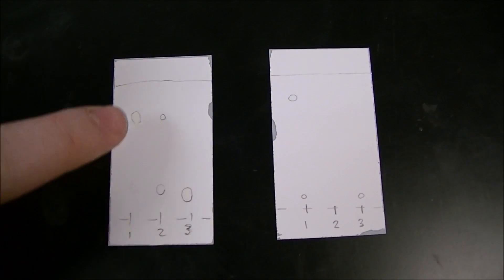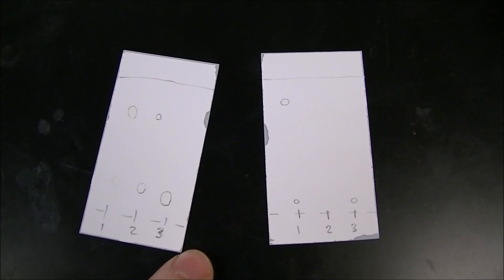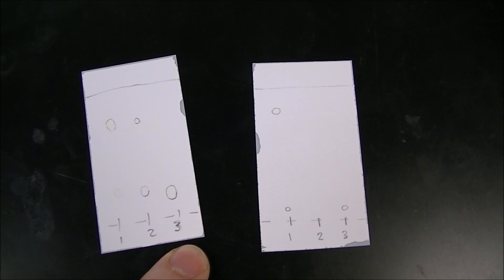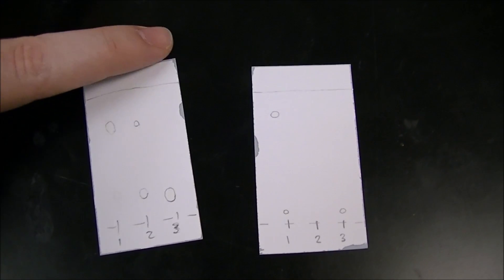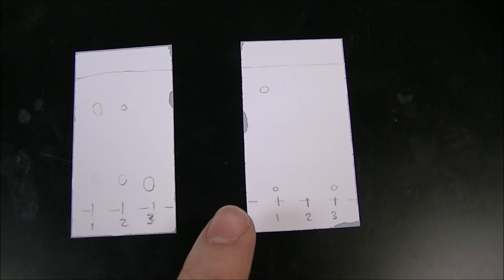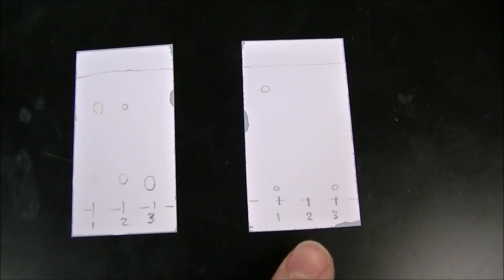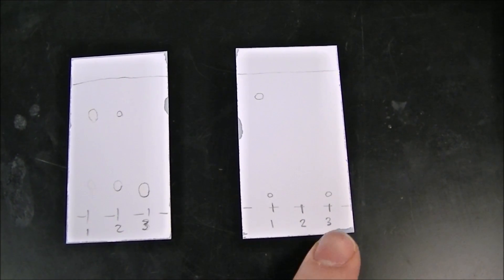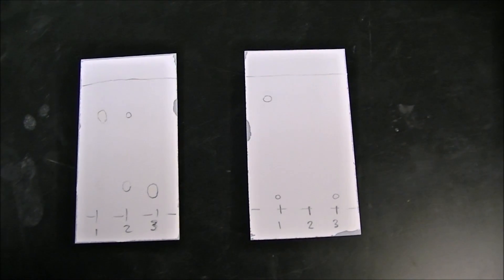But the separation in this lab isn't perfect and so sometimes you might see what's on the right where the first collection you make is more like a half and half. You don't see anything in this second lane and you can see a stronger cis isomer in the farthest lane.